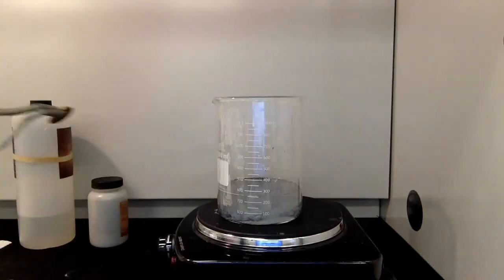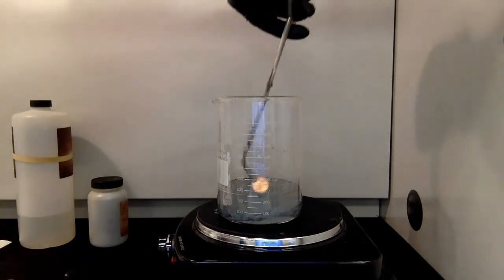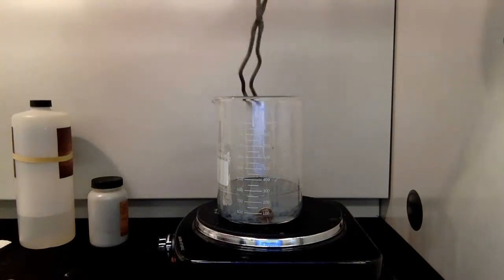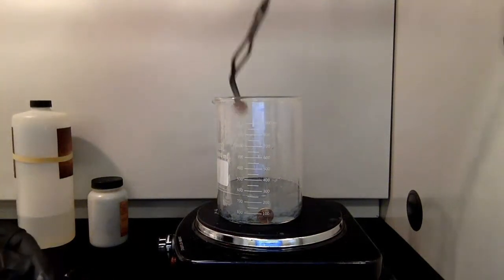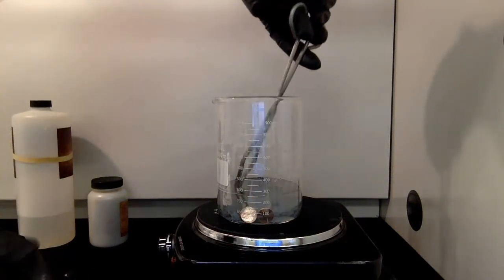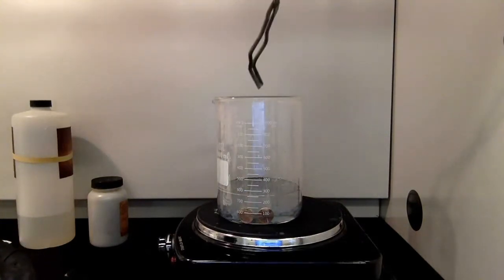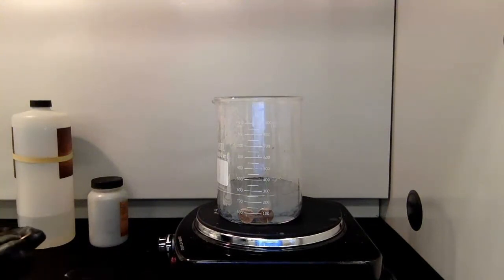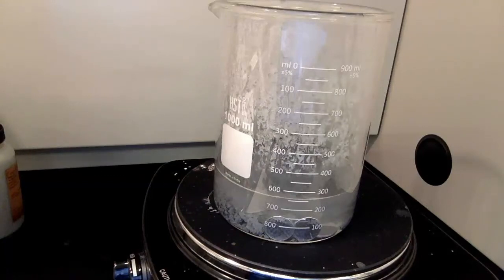Now I'm going to carefully place these pennies. I don't want a whole lot of splashing, so I'm going to carefully place these pennies where hopefully we can see what happens in the process. I'll try to stand them up a little bit so you can see the change that occurs during the coating process, where these pennies are plated essentially with zinc, and it causes them to appear to be silver in color. Hopefully you can see the silver coloration on these pennies.